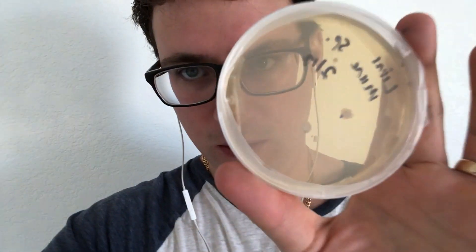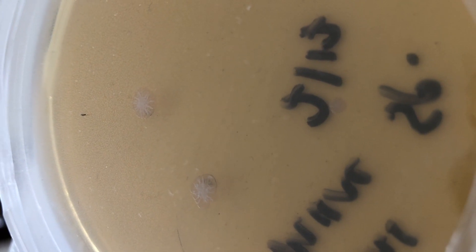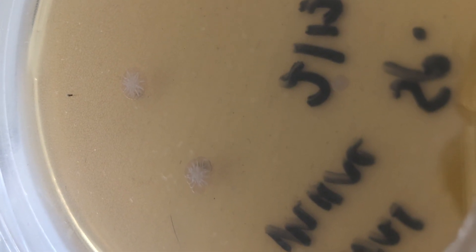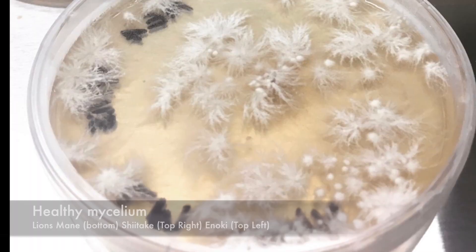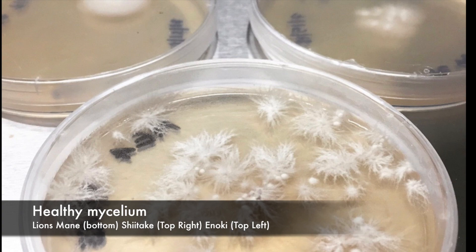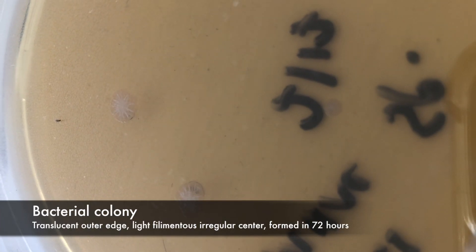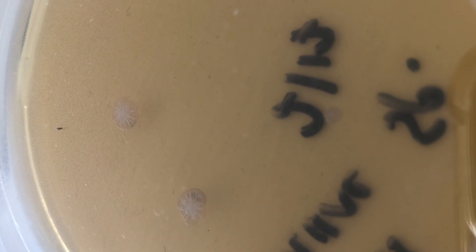When I do a close up you can see a little bit better. You can see those two colonies with the blotches kind of around their perimeter — don't be fooled, those are bacterial colonies. Don't mistake that for mycelium. At this stage the mycelium would almost look grainy, and it wouldn't have that perimeter of blotchiness around the side.